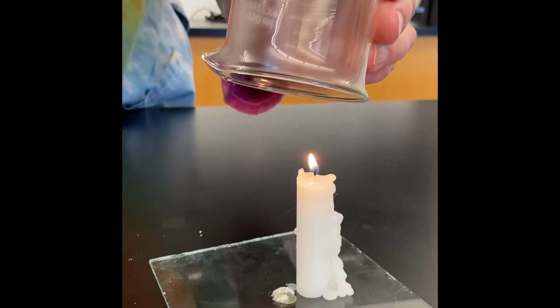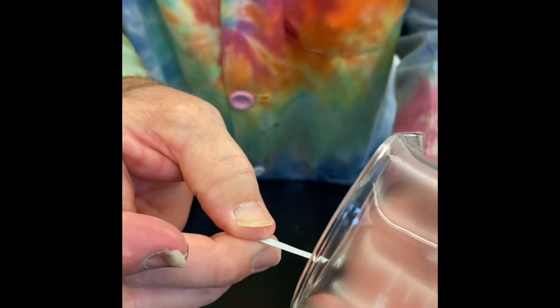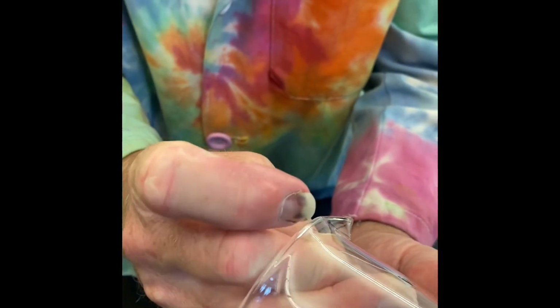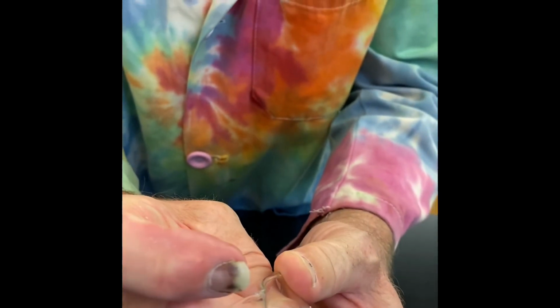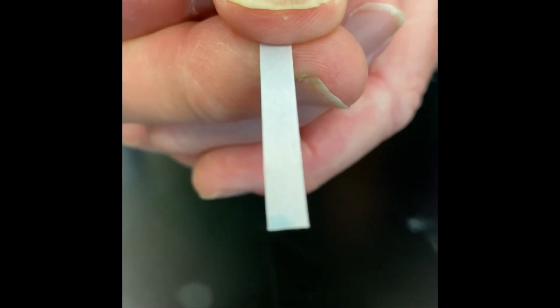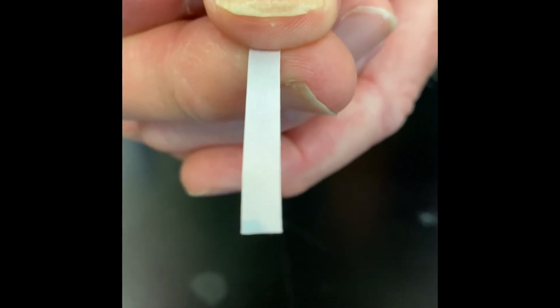Now I'm going to test it with the cobalt chloride paper. So I could turn the beaker over, and I'm going to take this cobalt chloride paper and wipe it on that material. And again, we are looking for a color change from the cobalt chloride paper, which was blue, to this almost whitish pinkish color.